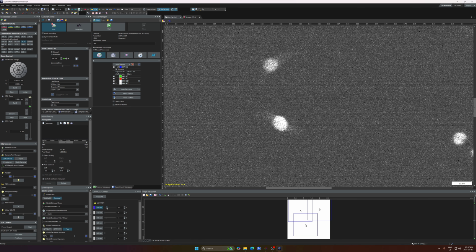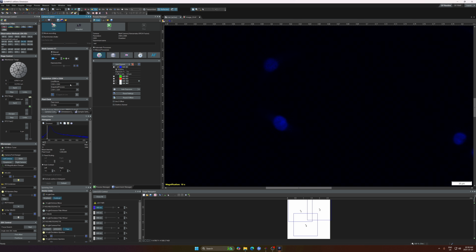So let's say I will just enter 200. And now the trouble is this discrepancy between this exposure time, which is live, and the acquisition time. In this instance, you have to read the setting from what's active. It will input that number into this. So we're done with this step.